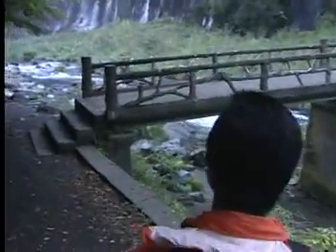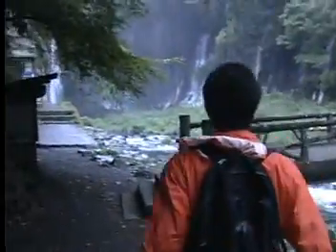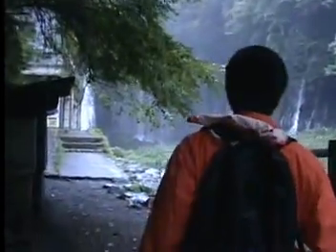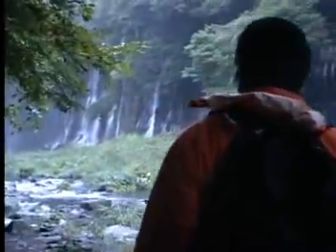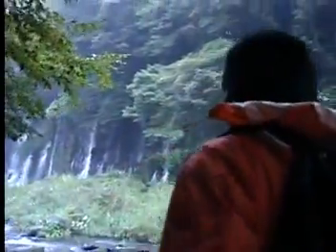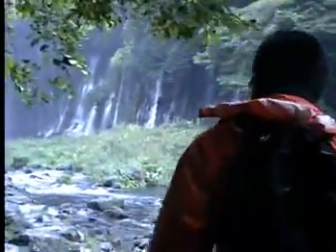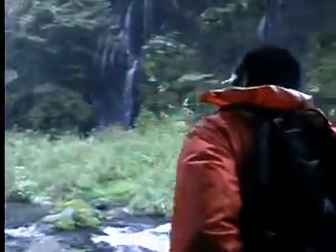We begin by collecting a sample of the water that we want to observe. Here, our researcher is at Shiraito no Taki Falls, a well-known spring on the slopes of Mount Fuji.